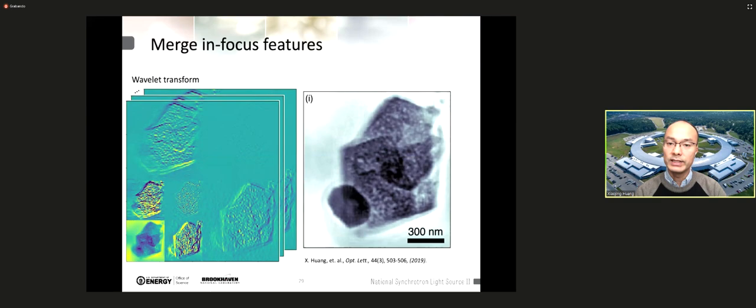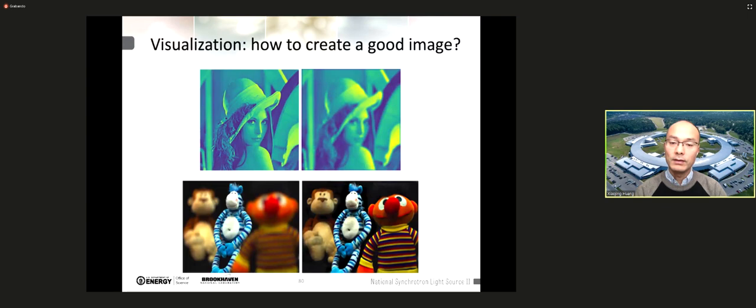Okay, so now we present two techniques: multi-slice ptychography and a focal stacking technique, which can extend the depth of focus without losing information. Okay, so now let's look at the pictures we showed at the very beginning of the talk and ask the same question again. How to define a good image for visualization purposes?